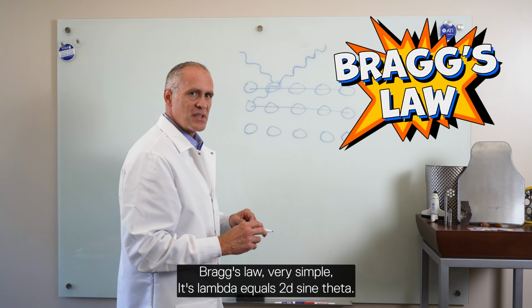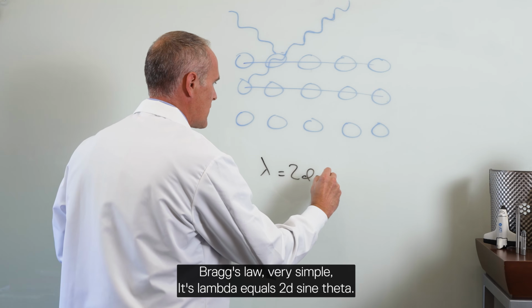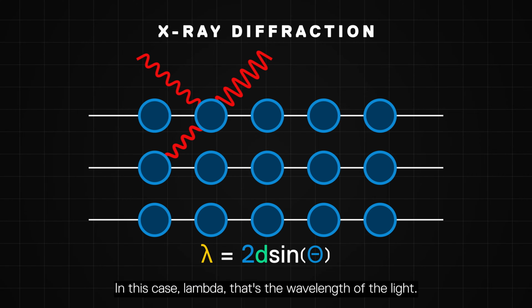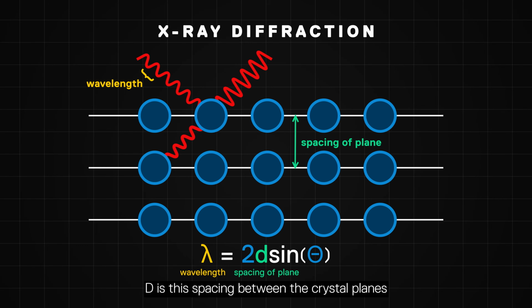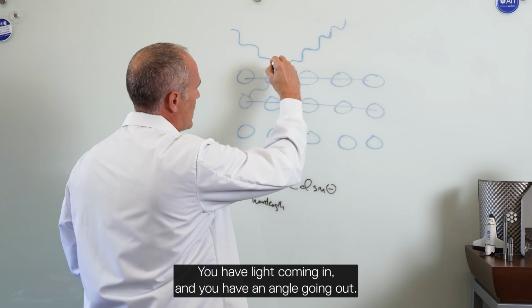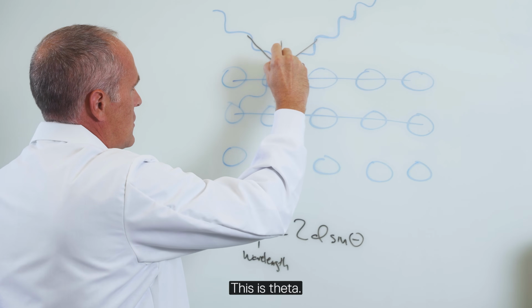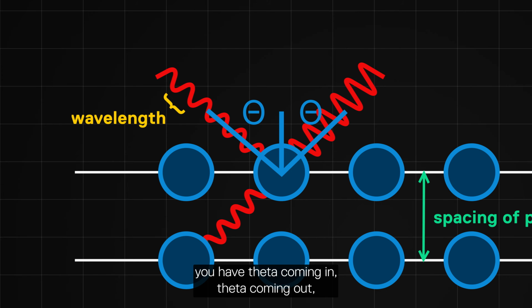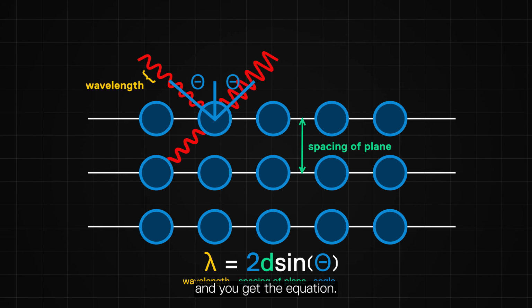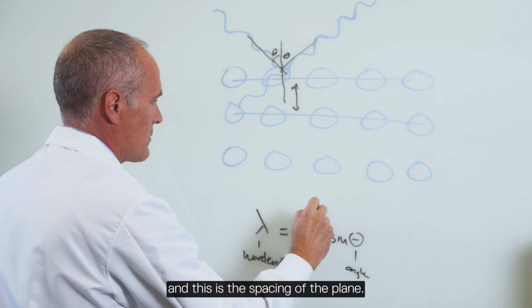So Bragg's law, very simple. Lambda equals 2d sine theta, right? So in this case, lambda is the wavelength of the light. d is the spacing between the crystal planes, and theta is the angle. So you have light coming in, and you have an angle going out. This is theta, right? So you can measure, and that's where the 2 comes from. You have theta coming in, theta coming out. It's 2 times the theta, and you get the equation, right? So this is the angle of the light coming off, and this is the spacing of the plane.